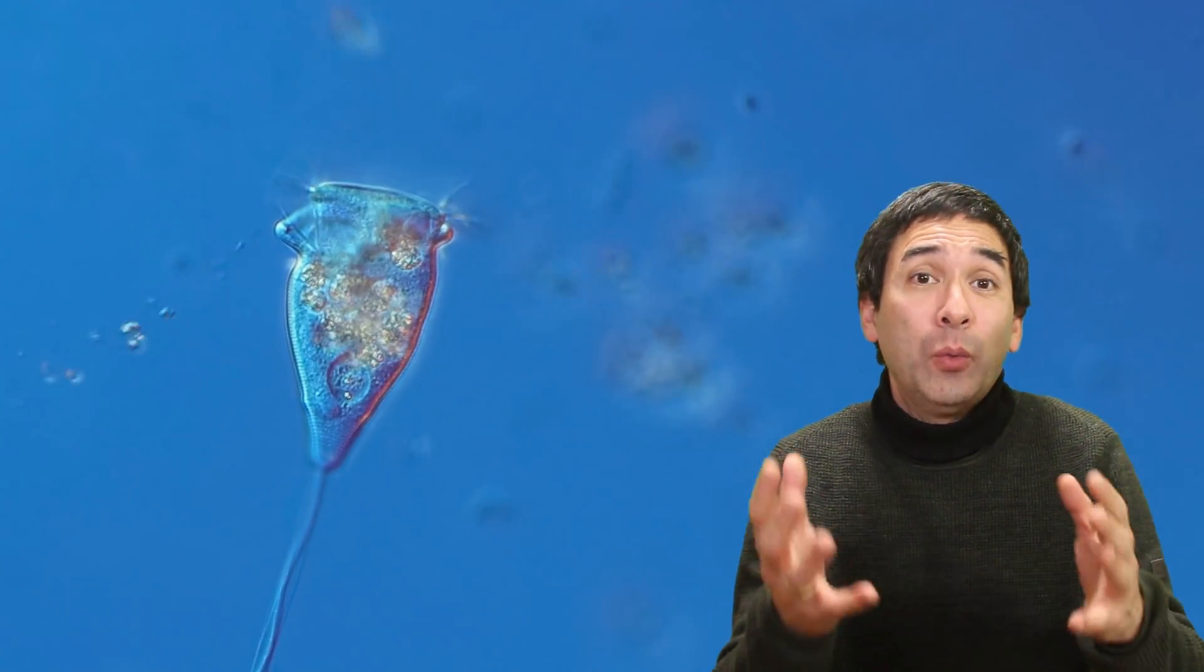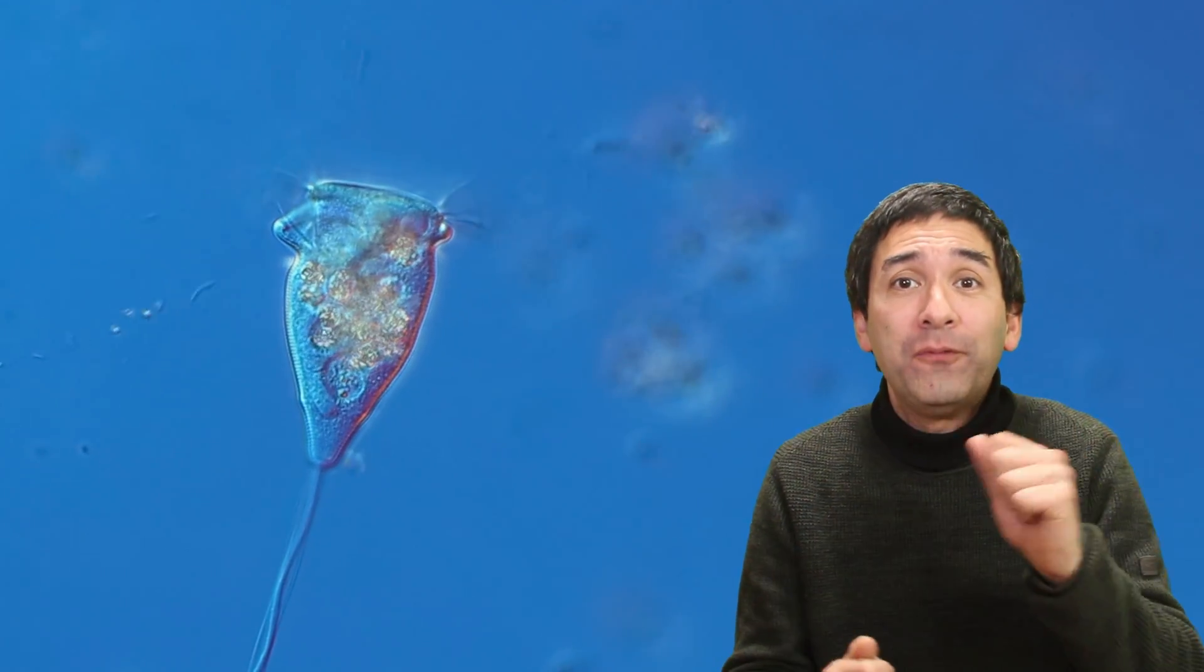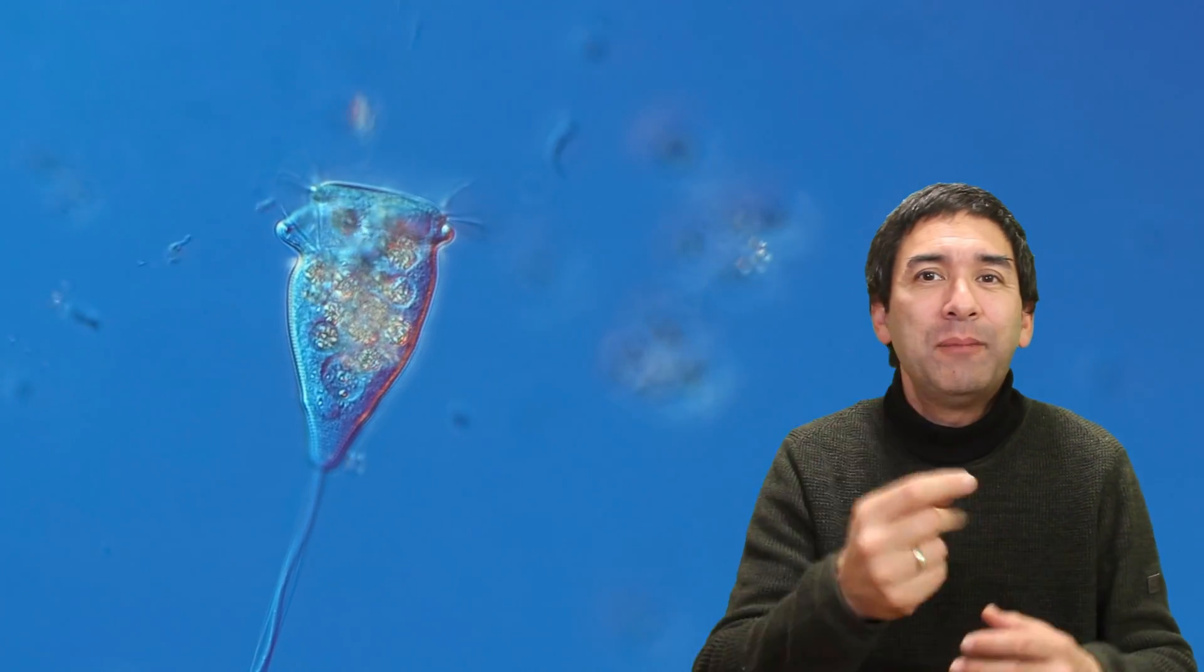How fast is it? Well, watch this. I will count down from five all the way to zero, and at zero I will snap my finger like this, and then you can see actually what happens.